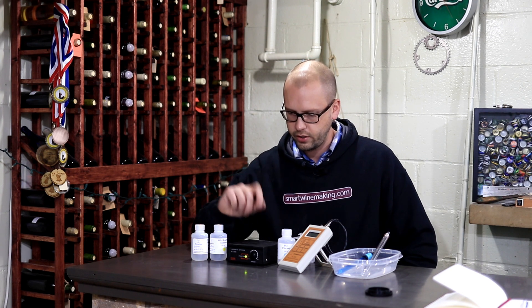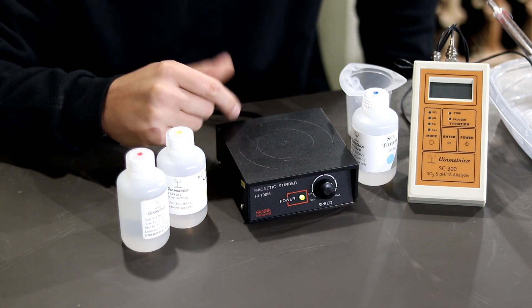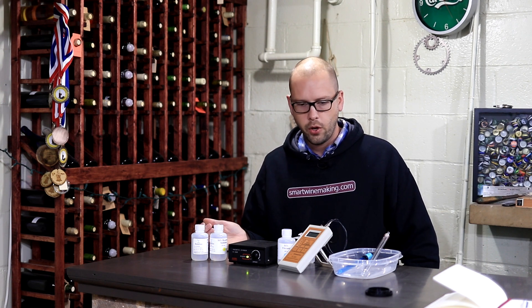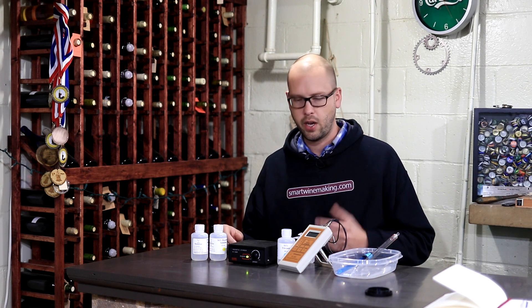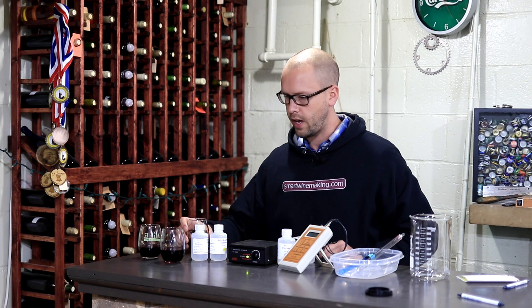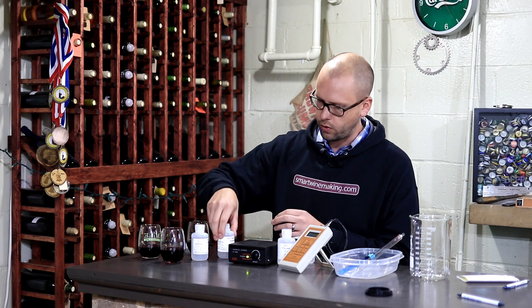I've got a HANA stir plate that I use for anything I have to continuously mix, but you don't really need this — you can run the test just by constantly swirling it; it just makes things a little bit easier. We want to grab some samples of wine. You don't want to let them sit forever because those sulfites are going to oxidize. I've got my three samples here with little numbers on the sides of the glasses so I can keep track of everything.